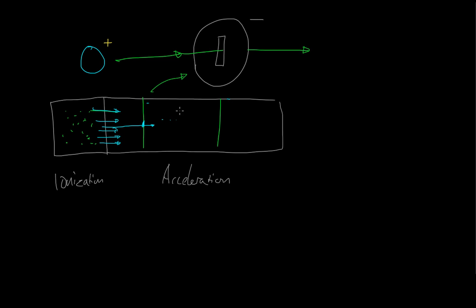And then we're going to have a few more spread around like this, out of all of these, and then only the ones going through this one are going through. So we've focused down the beam to a point where we had lots and lots moving all at the same time to a finely focused beam to an even finer focused beam. So we have condensed down that beam into one almost single beam of ions.